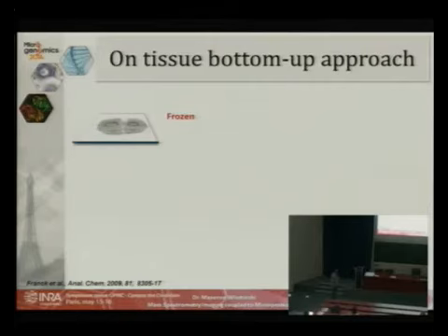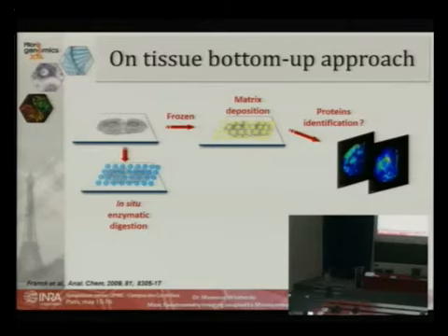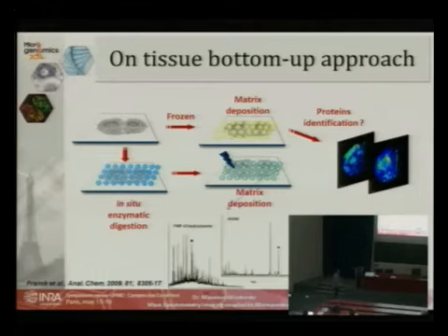We first perform mass spectrometry imaging to obtain the localization of intact proteins, and after we deposit, on a consecutive or on the same section after removing the matrix, an enzyme, typically trypsin. The trypsin will digest the proteins locally, and we can then cover again with the matrix and realize another image, but this time of digested peptides.